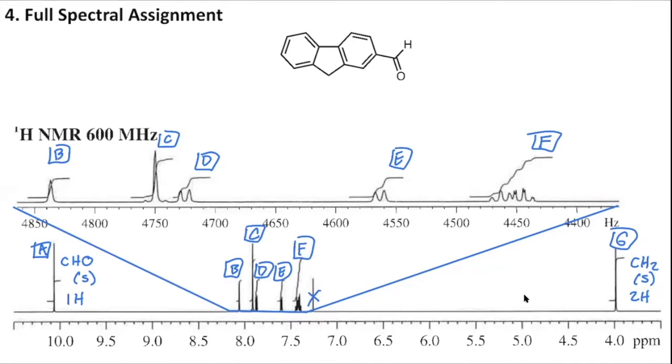So looking at peak B, let's just think about the peak shape and see what that tells us about B. It looks a little broad and lumpy to me, but I can't really see anything else happening at B. So I would characterize that as a singlet. So we'll just label that here. And then let's go along and look at the peak shapes of all the other ones, and then we'll come back and talk about the integrations last. If we look at C, again, a little bit broad, but I would again characterize that as a singlet, whereas now we look at D, D definitely looks more like a doublet to me, as does E.